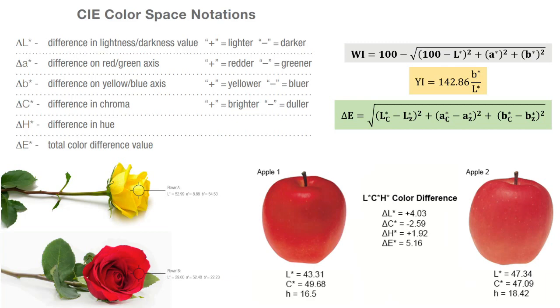Otherwise, with the naked eye also we can tell this is yellow, right? But when you are going for some biological experiments, the color might be a little bit the same, but that minute difference in color can explain a lot of things that we can't predict with our naked eye.